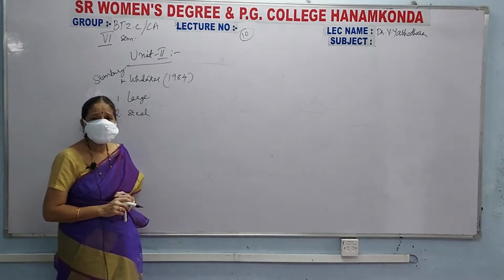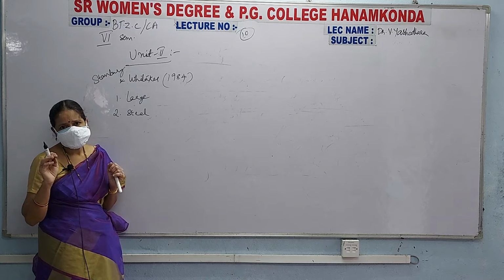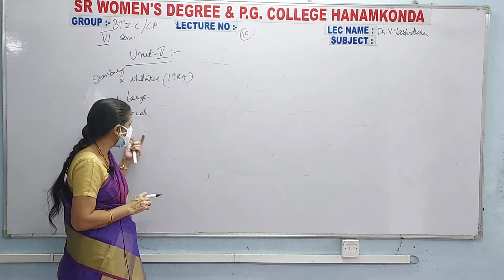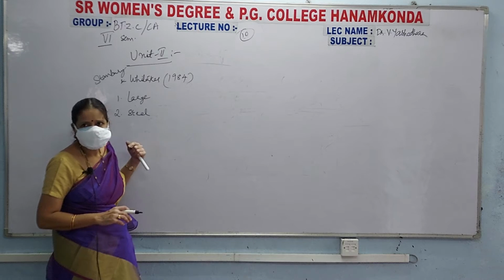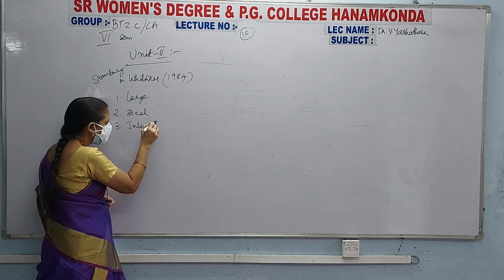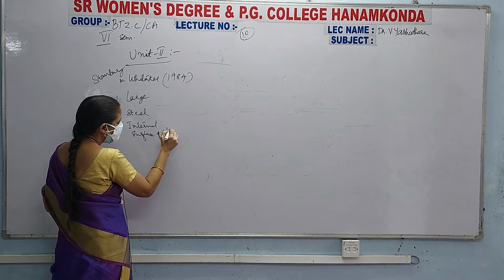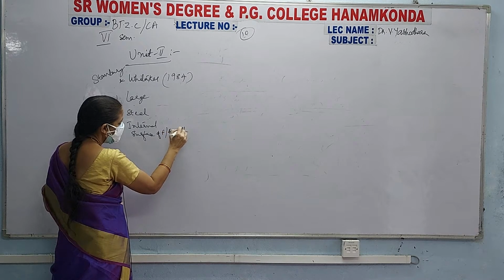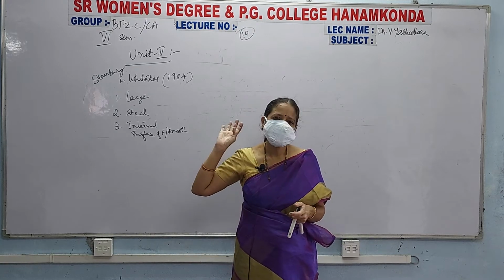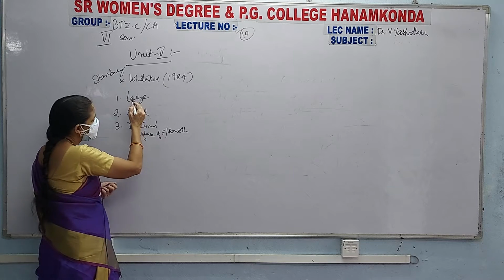Why? Because the stainless steel will not react with the chemicals that are poured into the bioreactor. అంటే బయోరియాక్టర్లో వేసిన ఆ కెమికల్ న్యూట్రియంట్స్తోని ఈ స్టీల్ అనే మెటల్ రియాక్ట్ కాదు కాబట్టి వి ఆర్ యూజింగ్ స్టీల్, బయోరియాక్టర్స్ షుడ్ బి కన్స్ట్రక్టెడ్. ఓకే. Third one, the internal surface of the fermenter should be smooth. అంటే ఫెర్మెంటార్ లోపల భాగము స్మూత్ ఫినిష్తో ఉండాలి. It should be smooth finish, or you can also call it a glass finish. నౌ స్టీల్తో తయారు చేసి ఉండాలి, లార్జ్ ఉండాలి.